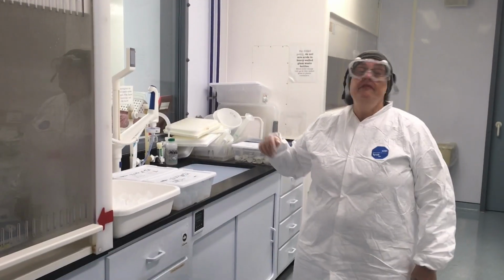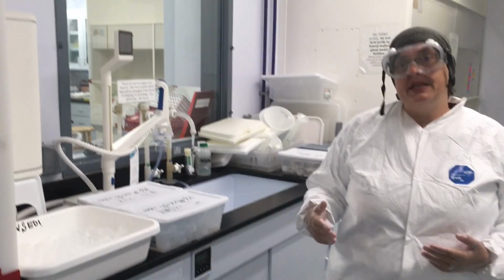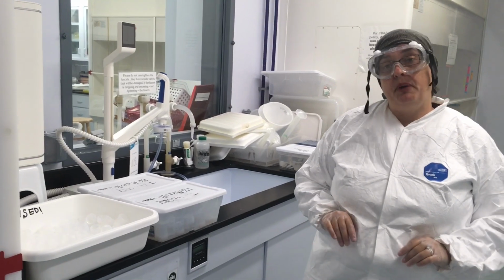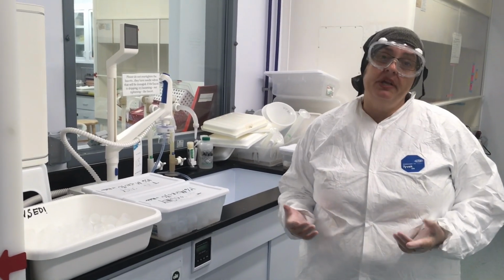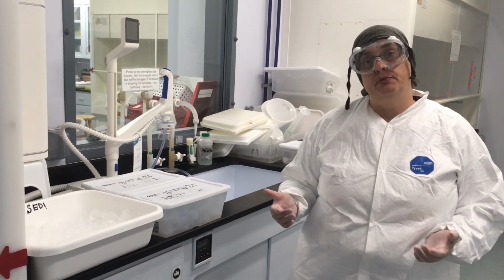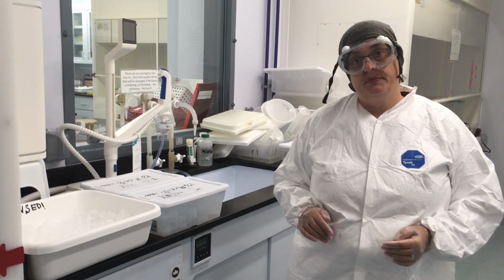So we have very high quality water. Our water goes through many steps of filtration to reduce the trace metals as low as possible. This is in part because a lot of what we do is not just concentrations, but we do a lot of isotope ratio measurements. And often those can be very, very sensitive to contamination.